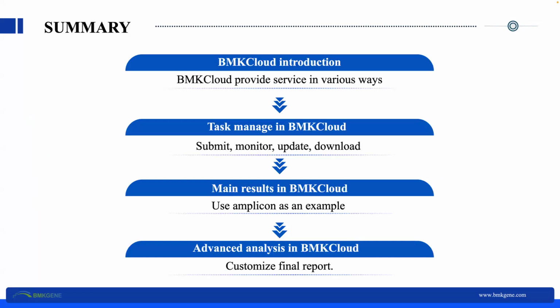Let's summarize the whole analysis. This is the summary of the whole presentation. The first part I introduced about what's BMKCloud and how BMKCloud provides service in various ways. The next part we talked about task management in BMKCloud, such as how to submit, how to monitor, and how to update and how to download.